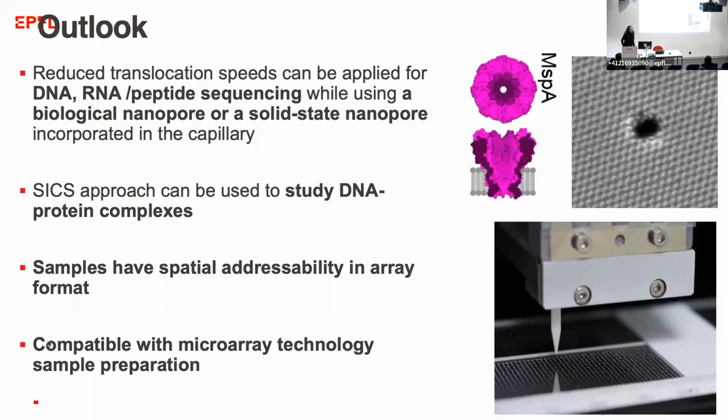And to get smaller capillaries, I believe we exploited some of the ways, but using the scanning electron microscope, this is where we stop because of the charging, so we cannot go further down. But embedding a biological pore or another type of material that we work with in the lab, such as 2D material, with a very small probe would likely push the resolution even further.